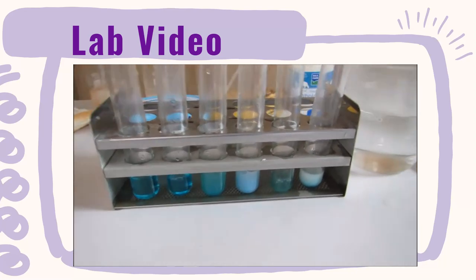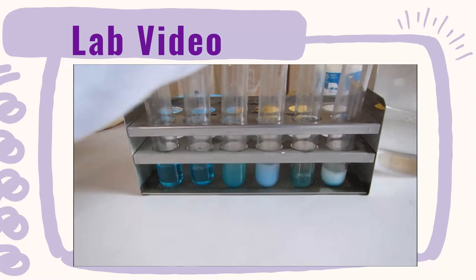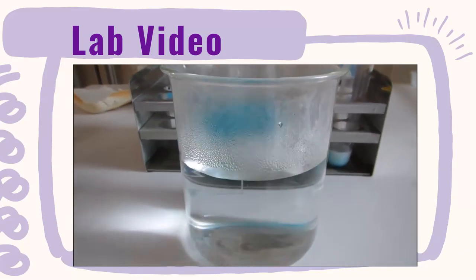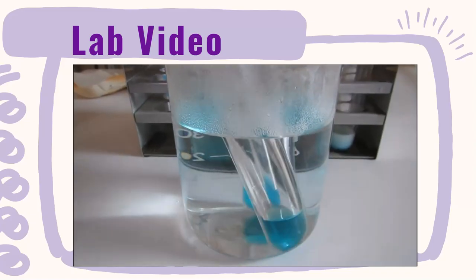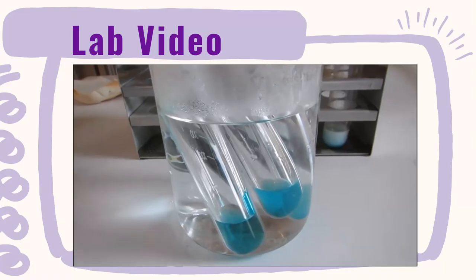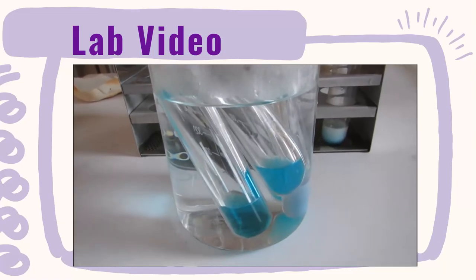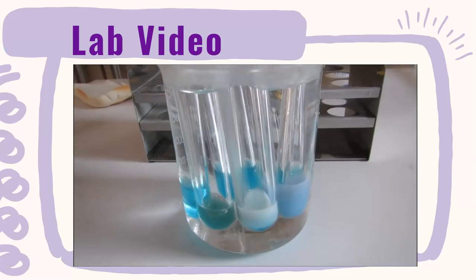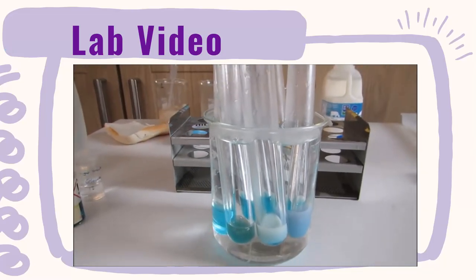So again, it's blue in color. It's very similar in color to the Biuret reagent that was used for the protein. If you look at all of them, they all look pretty much the same blue, but that's because to get the sugars to reduce, I actually have to add them to a hot water bath.